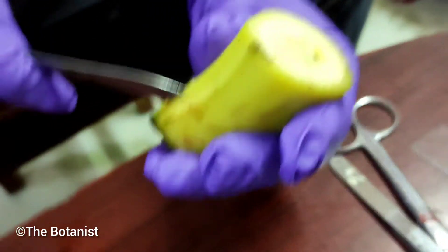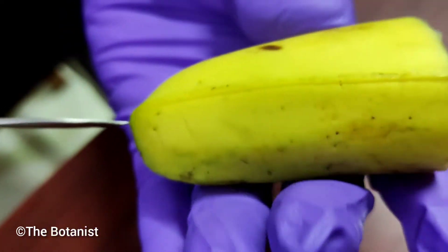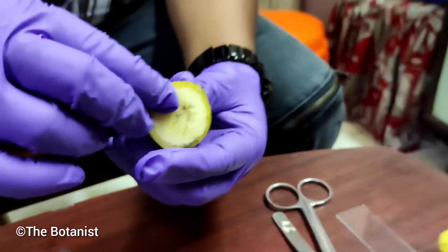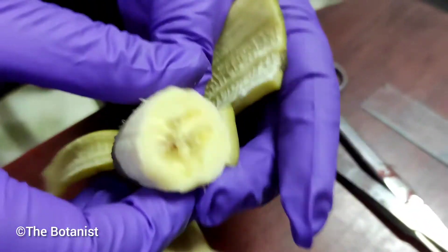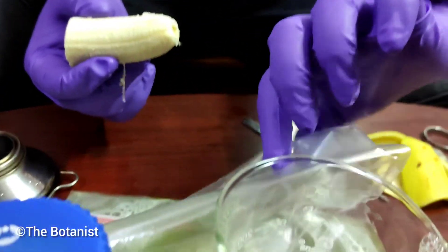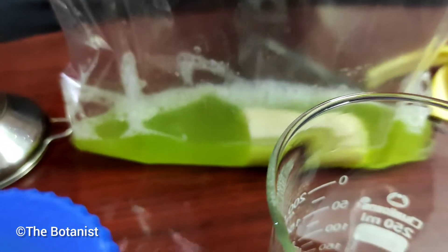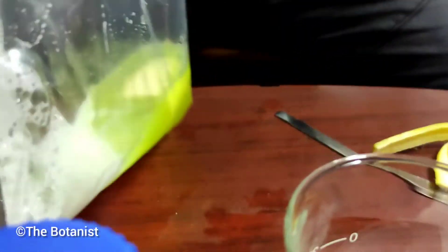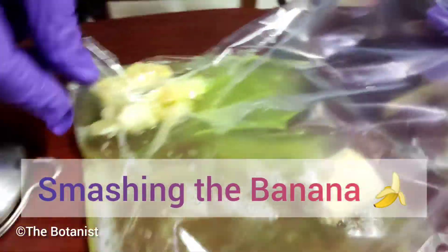Here we have added some liquid detergent. You can see that first we are taking the edible part of the banana and putting it inside the zipper bag. Now we have to smash it well and mix it well with the solution of liquid soap and salt.